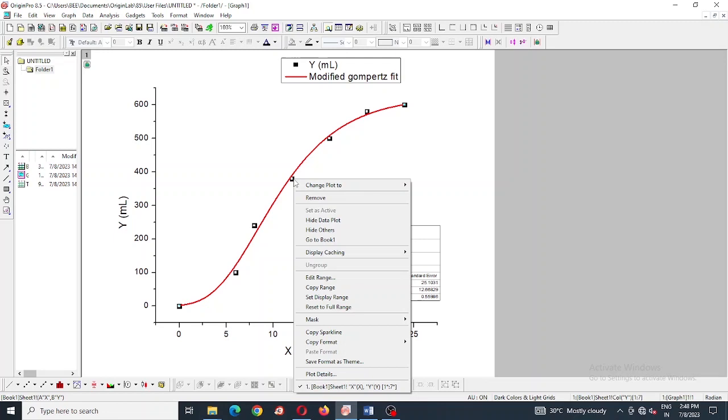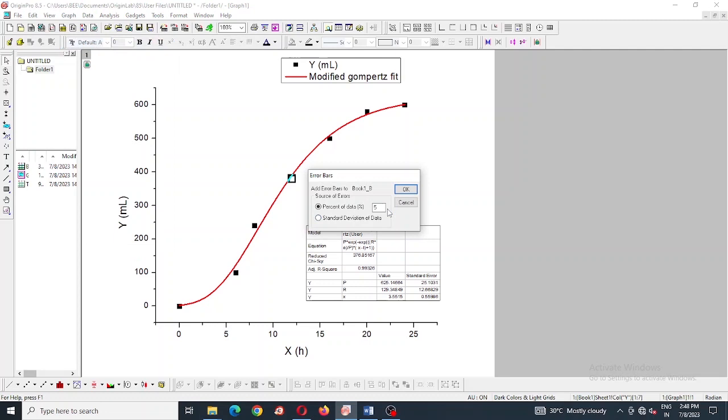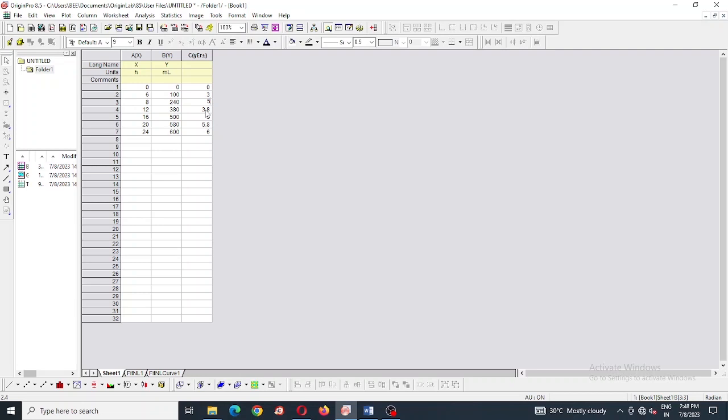Next, I am going to add the error bars. That's why I first selected the point and going to the error bar. Here I set the percentage to 1%, after that here we can add the error bar results. You can calculate here, or copy from Excel sheet, or any other document where you have it. You can just overwrite those values, and error bars will be shown.